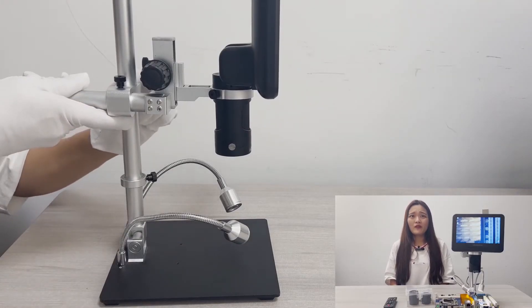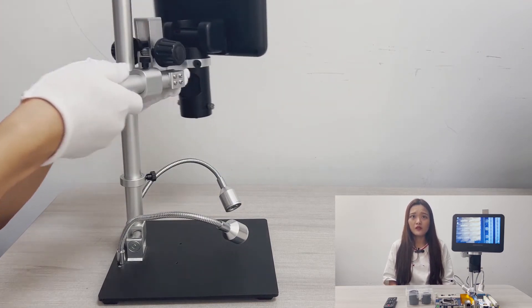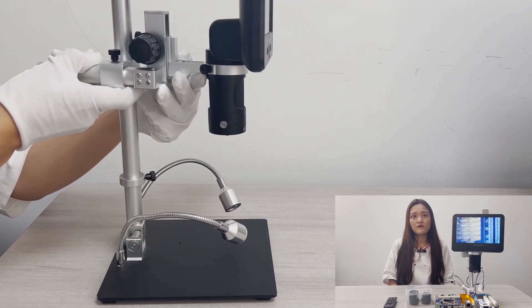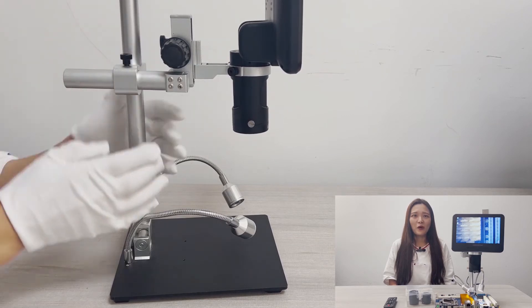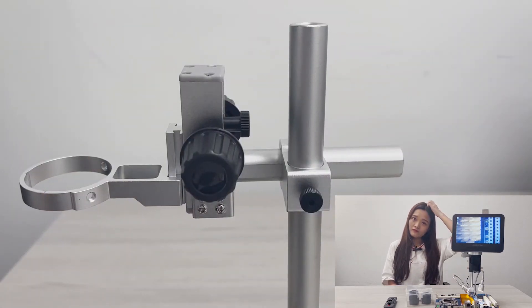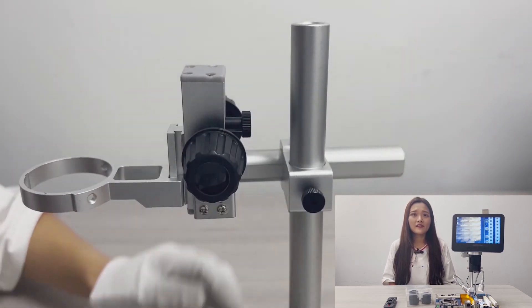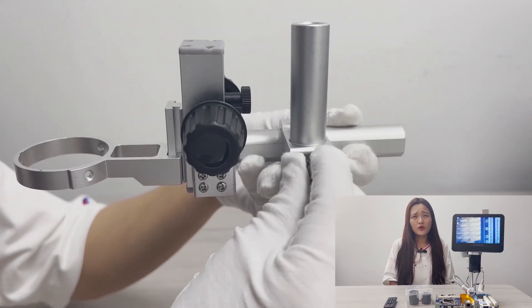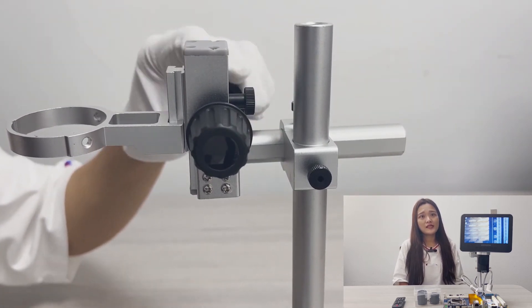To solve all the pain points, here comes our newest stand — I call it the mini boom arm stand. It's not a real boom stand that has a big working range, and not everyone has a big lab to let a boom stand freely move around in. A real firm boom stand does cost a lot. So you could think of our newest stand as a more cost-effective alternative, which can also realize boom stand work to adjust the optical stack horizontally and vertically, only in a smaller area. Compared to the old version, we also added a secondary bracket to this mini boom. Instead of adjusting the whole arm, which could cause obvious shake, now you could simply fix your arm to a certain height based on your working habits and then adjust the secondary bracket mostly.